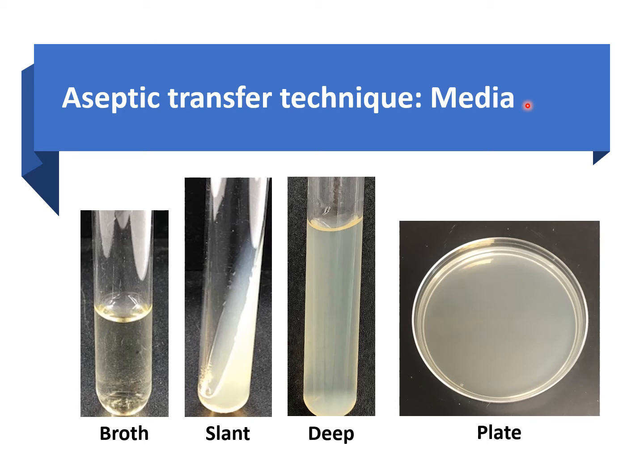Remember how we talked about the different chemical forms of media? When we talked about how we have a standard media, selective media, and enriched media, those are different chemical forms of media where you can add special nutrients, and therefore change the chemical form of the media. Right here, we're not talking about the chemical form of the media, we're talking about the physical form, okay?